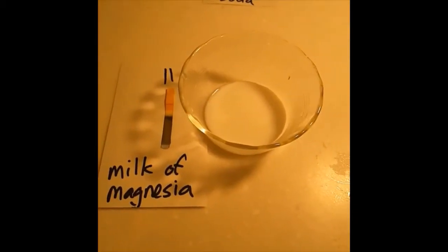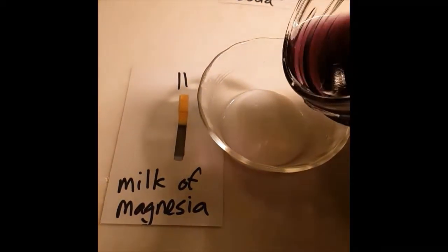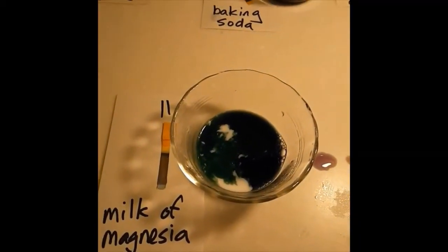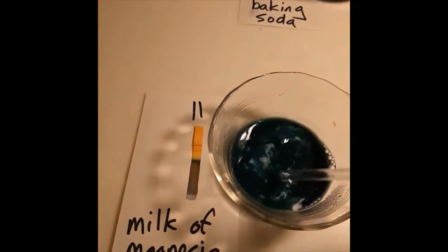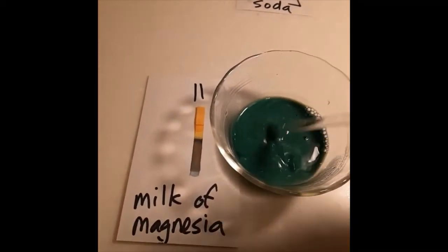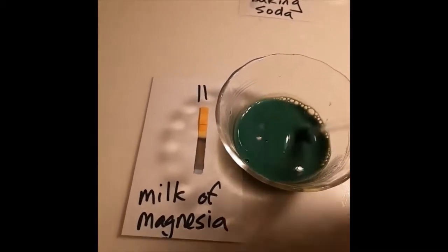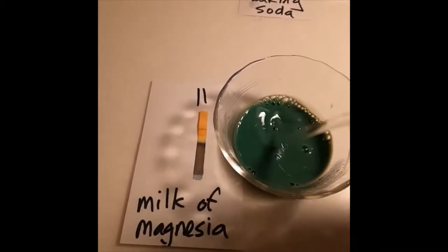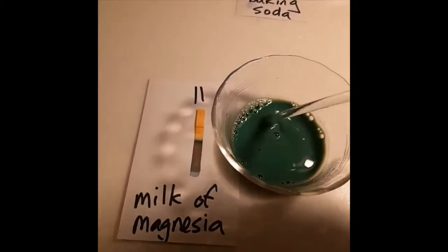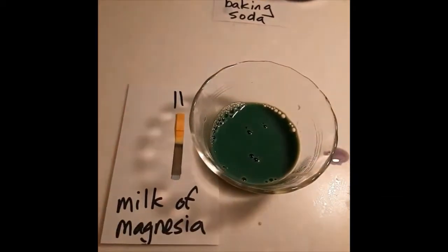Okay, this time we'll try the milk of magnesia. That should also be a base. Ooh, wow. There's some nice blue color. Oh, it's green. Oh, it's very green. The creaminess is from the magnesium hydroxide not dissolving, but wow, it is very, very green. That is impressively green.